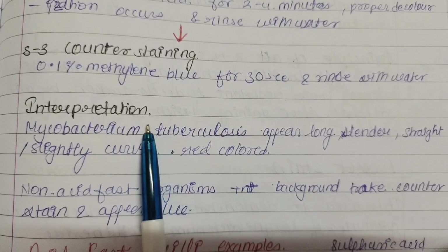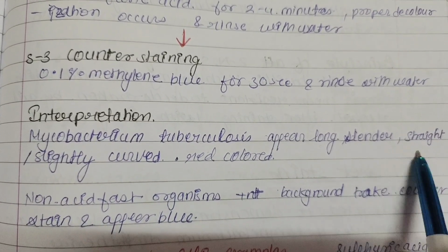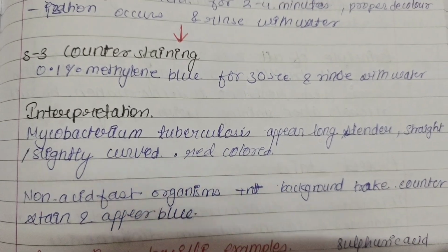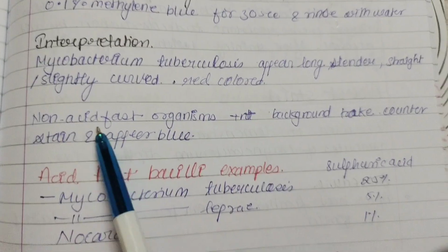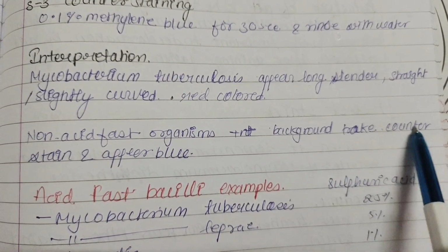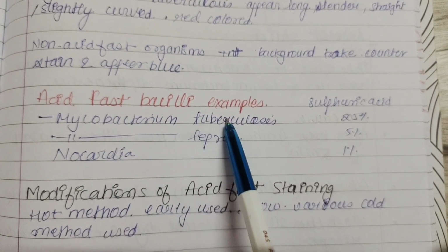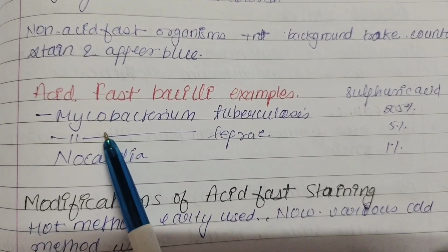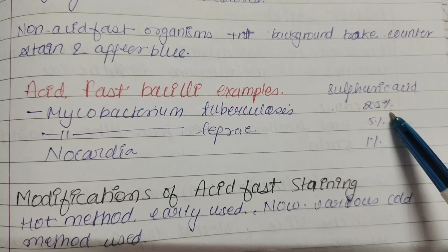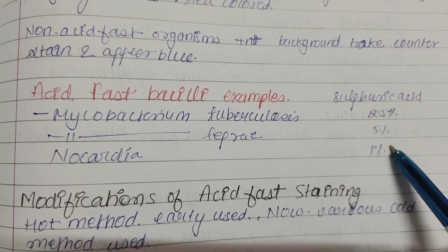Now the interpretation is that Mycobacterium tuberculosis appears as long, slender, straight or slightly curved red bacilli, and it is the acid-fast bacilli, and non-acid-fast organisms present in the background take the counter stain color and appear blue. Now the acid-fast bacilli examples are Mycobacterium tuberculosis, Mycobacterium leprae, and Nocardia, and the sulfuric acid percentages used for these bacilli are 25%, 5%, and 1%.